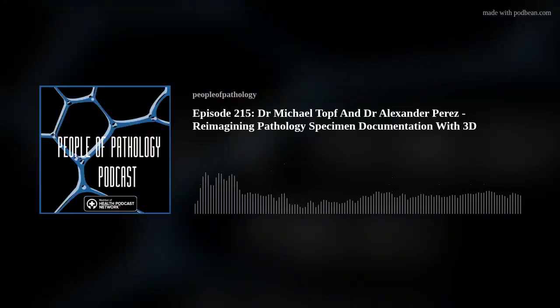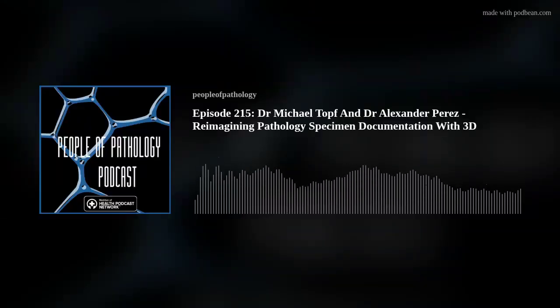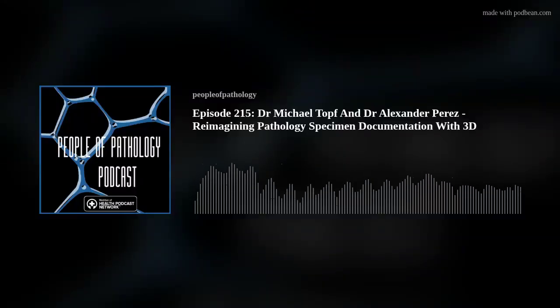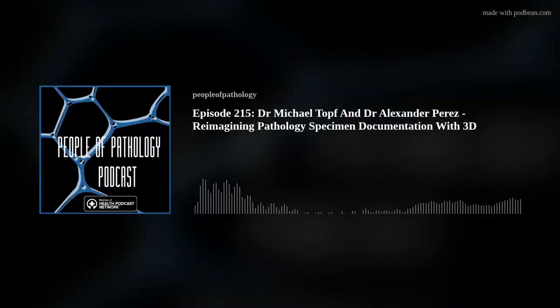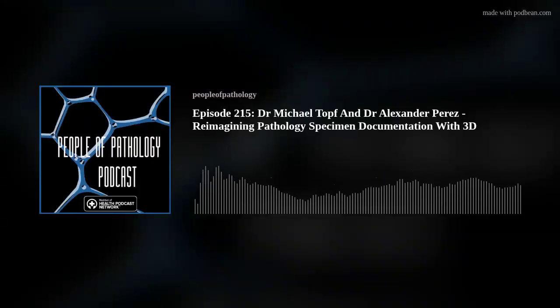And for head and neck, we try to do a lot of specimen-based margin analysis. So that's where the frozens and the margins are actually taken off the specimen. On the contrary, sometimes surgeons do tumor bed-based margins where they take the margins from the tumor bed cavity. But this is time added to the frozen section process, but these are often, in head and neck, very long cases where there are nodal dissections that need to occur. There are reconstructions that need to occur.